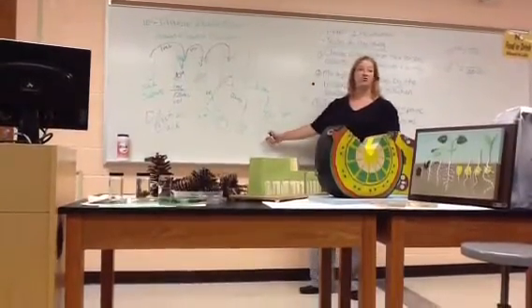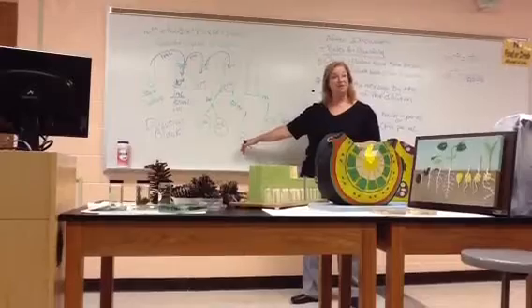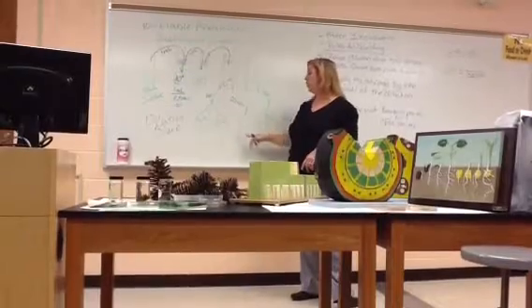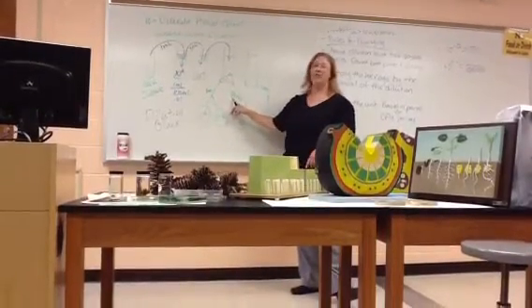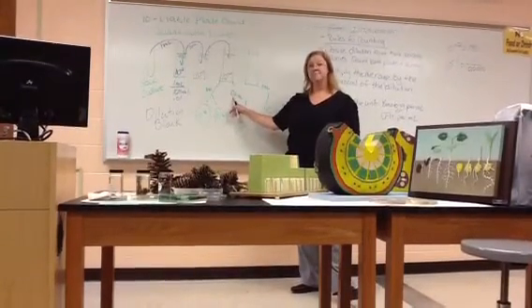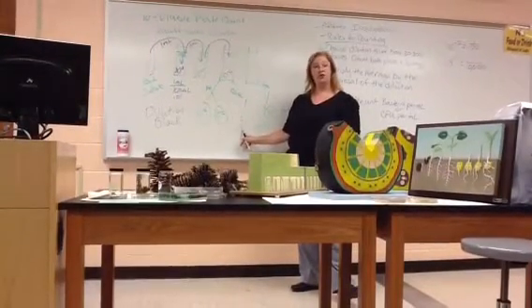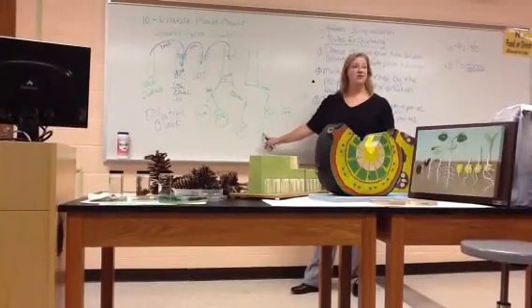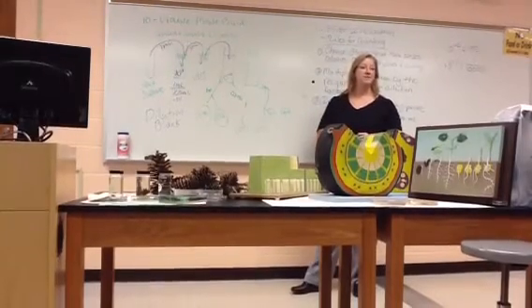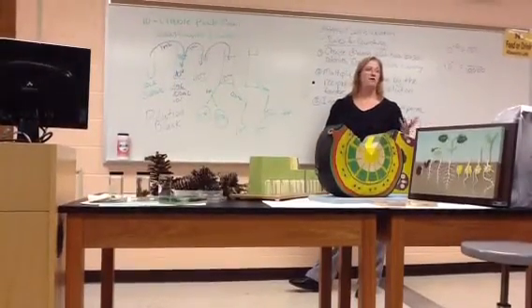We're going to get 2 more nutrient agar plates. And instead of making a separate bottle that we call 10 to the minus 7, we're going to cheat a little bit and use this 10 to the minus 6 dilution. Instead of plating a whole ml like we did here, we're going to plate a tenth of a ml, 0.1 ml. And we measure that with the pipette? Yep, you've got pipettes small enough to measure a tenth of a ml. And you put a tenth of a ml into one nutrient agar plate, make a duplicate, a tenth of a ml into a second nutrient agar plate, and label them as the 10 to the minus 7 dilution. Because they're just 1 decimal place off from the 10 to the minus 6, rather than making up a whole new bottle for 10 to the minus 7.